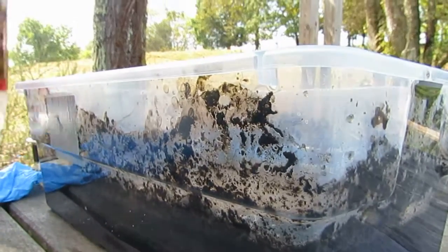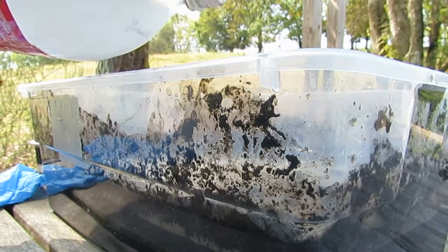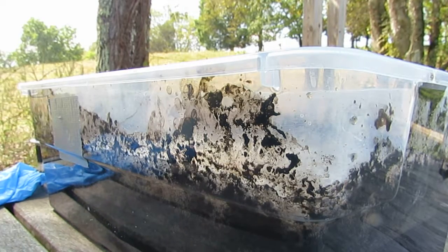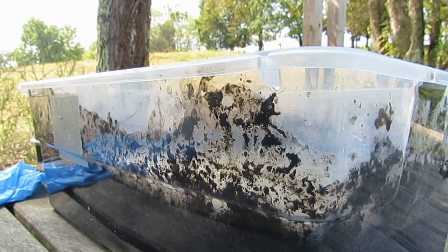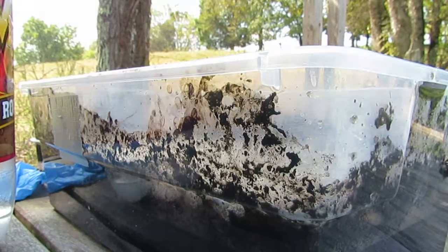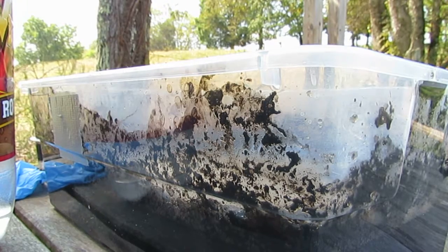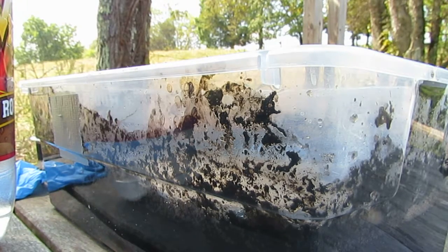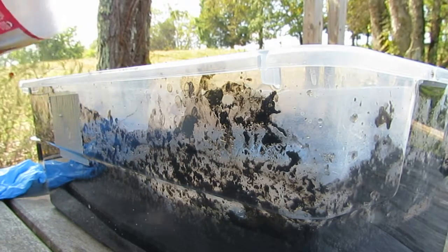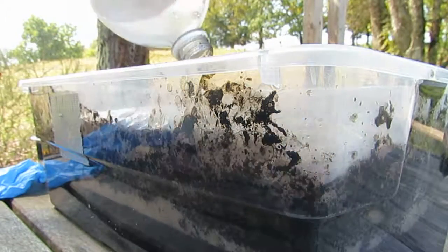I'm going to pour it in from a side angle. Now, see how milky this is? I put about two cups in. I forgot — there's a lot more. This is still off-gassing. Now that I'm neutralizing the acid, it is still producing carbon dioxide, or possibly a little bit of sulfur dioxide.